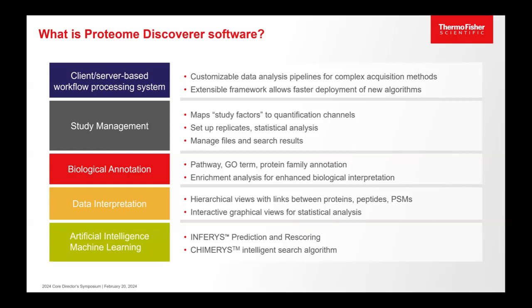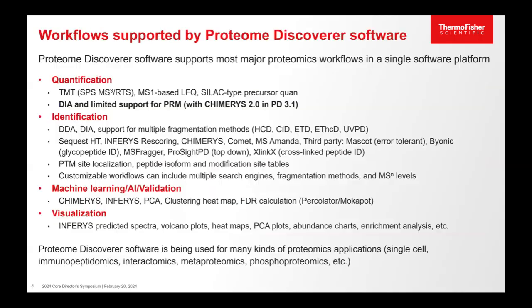And then finally, in the last releases, we've been trying to put more effort into using AI-based tools to increase confidence, increase the amount of IDs that you can get from a given data set. So there's a lot of words here. You'll get these slides later. You can look into it.